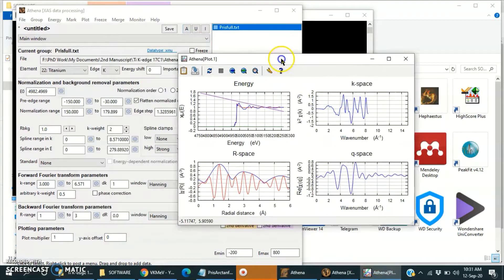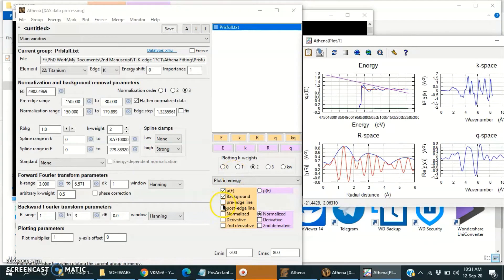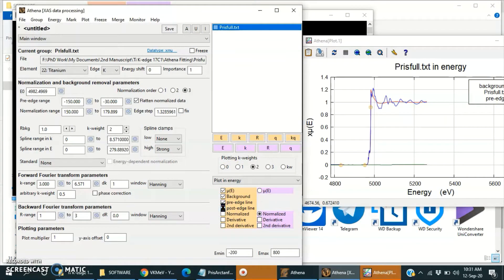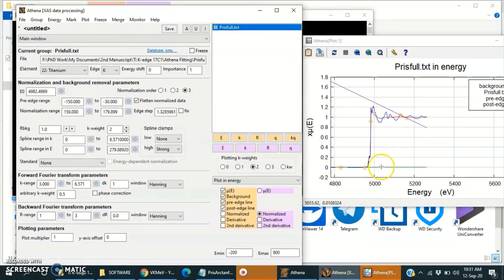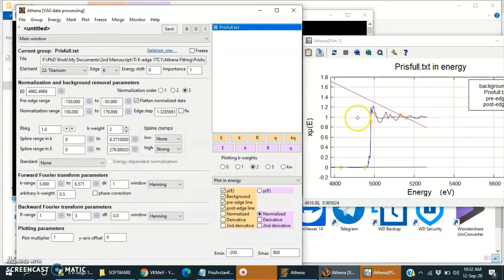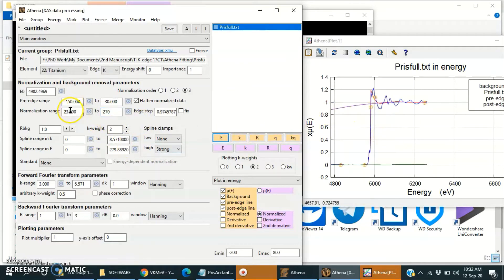Now the plot is here. In this we can see the pre-edge and post-edge lines. This is the pre-edge line and this is the post-edge line. The post-edge line is not going through this region because it is normalized from 0 to 1, as we can see it is already normalized, but the line is not concerning this normalization.